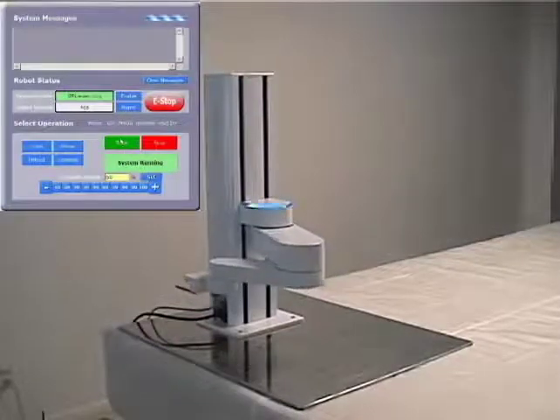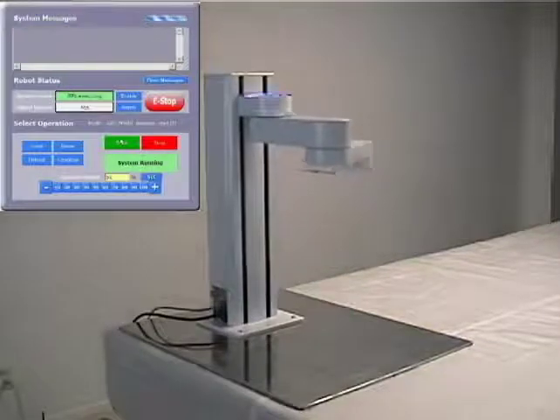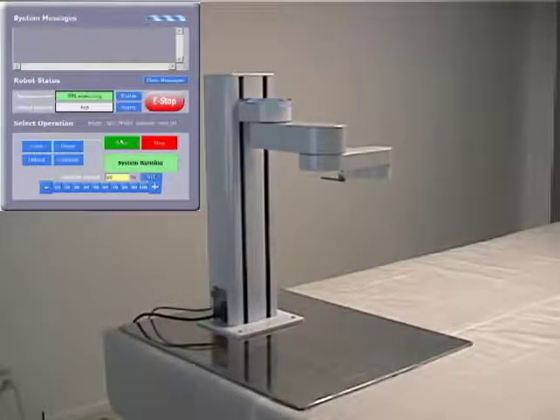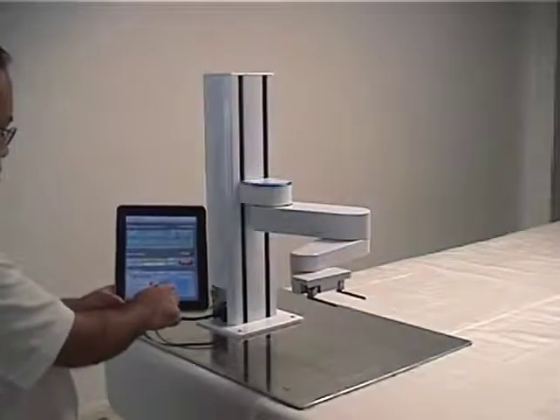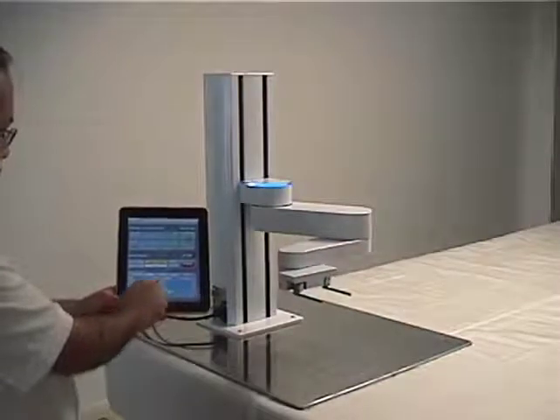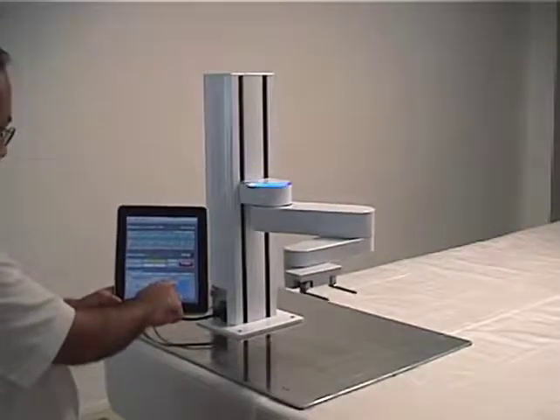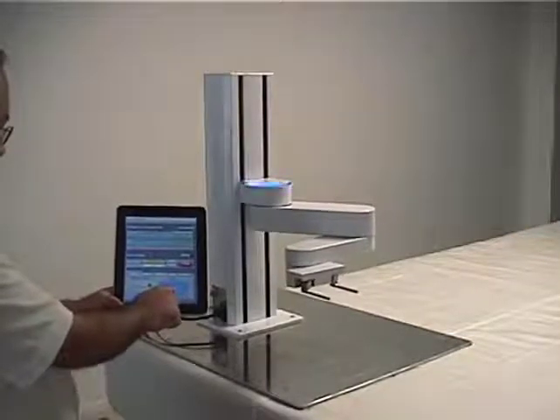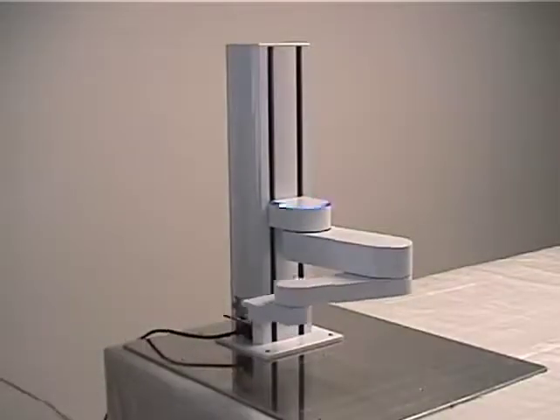This is extremely important in non-traditional collaborative robotic environments where elegance of motion and noise control are critical. There are several ways the robot can be controlled, including slaving it to a PC or other equipment using a TCP/IP Ethernet protocol, using a wireless router, and controlling it with a tablet such as an iPad or other wireless devices such as an iPhone. It can also run standalone using the robot's built-in programming language.